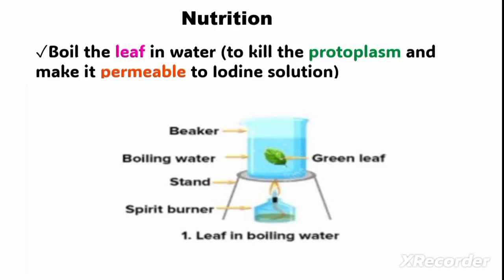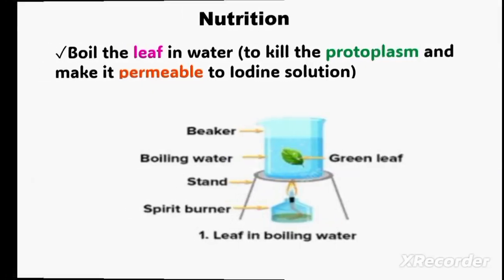As we can see, the experiment has been set up. We can see the beaker, the boiling water, the green leaf, the stand, and the spirit burner. The leaf is being boiled in water.